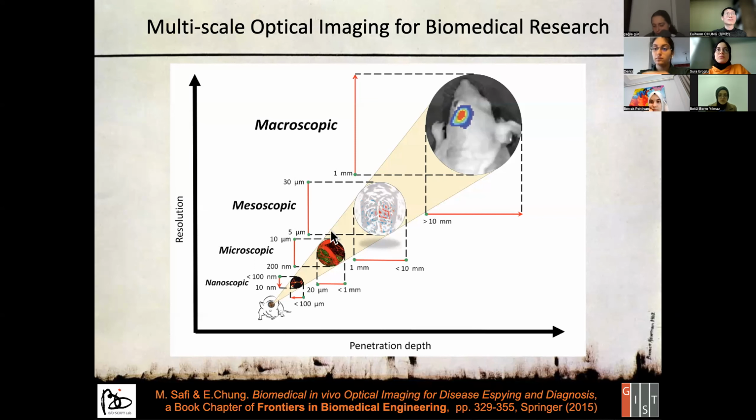But when we talk about microscopy, this is really about the micron level, and that's what you may know already. The cellular scale is micron. This is an example picture showing blood vessels and very small capillary vessels. The green color is coming from GFP-labeled tumor cells. The cancer cells express color so that you can see whether cancer cells are growing. This is at the scale of the microscope. You can see individual cells. Between these, we call it mesoscopic.